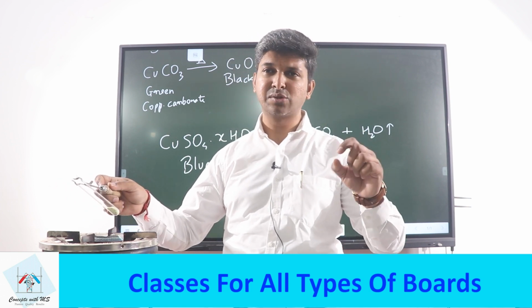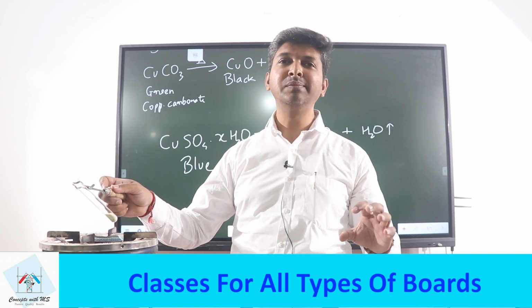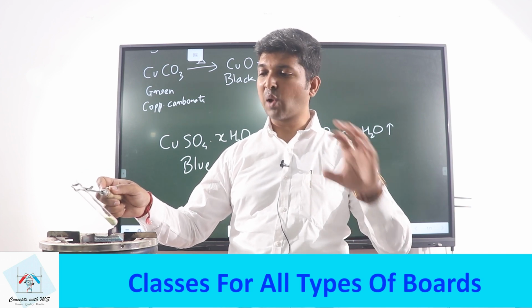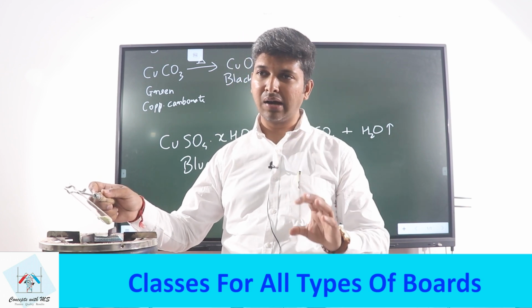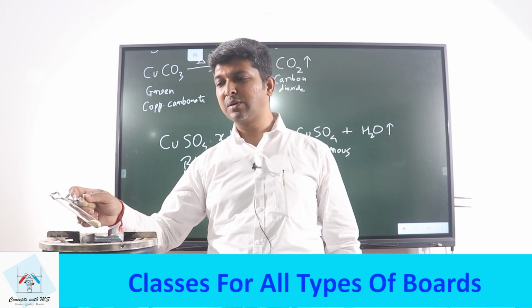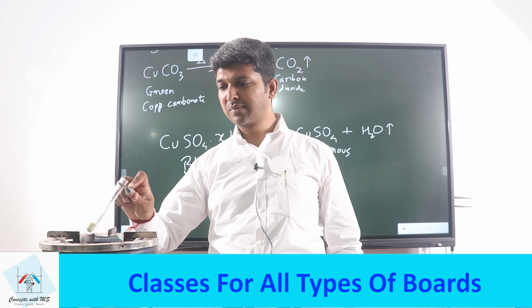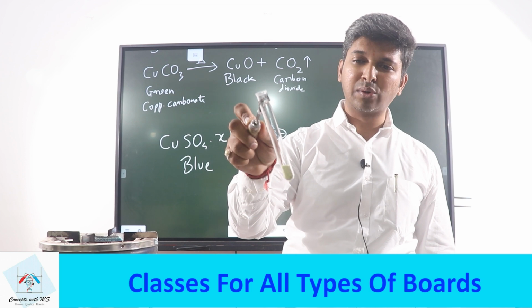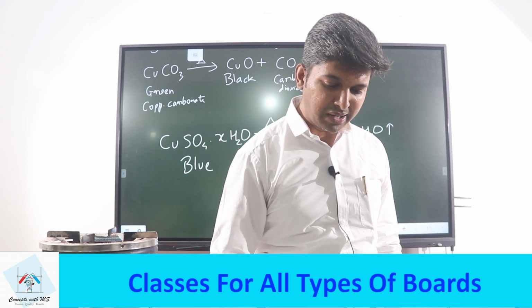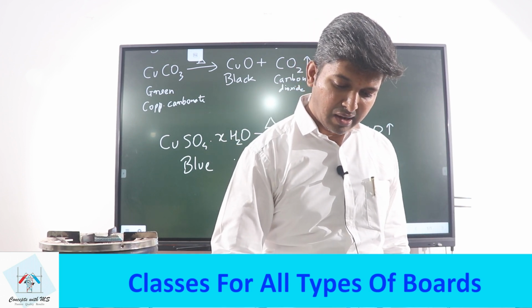It's because of the F centers. You're going to see F centers in the solid state chapter. Because of F centers, this acquires yellow color when hot and white when it is cold, right? You can see that here there is a yellowish tinge, and if you allow it to cool, it's going to turn completely white. Okay.